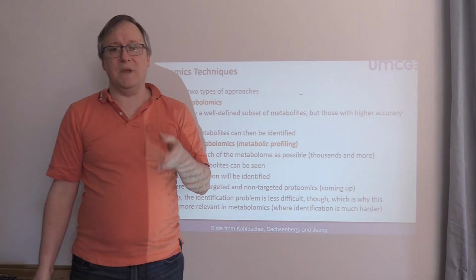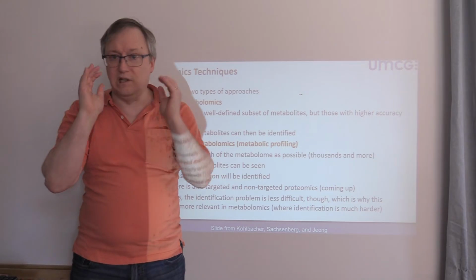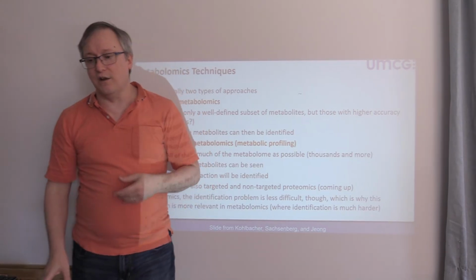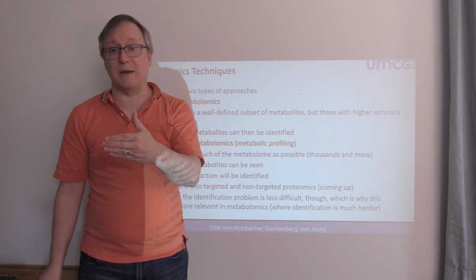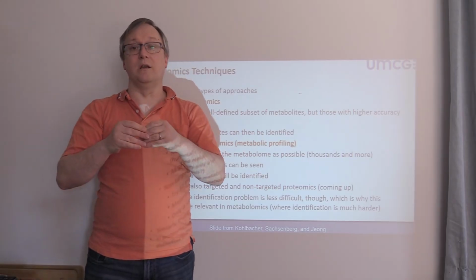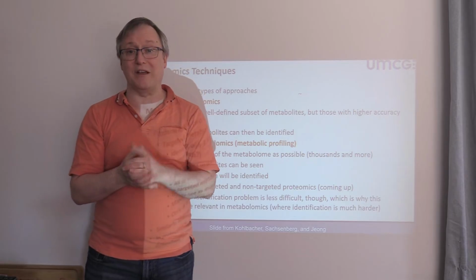But it may be that the answer you're looking for lies within the world of lipids, for example, or within the world of sterols, something like that. And for that purpose, we would be able to know what type of separation chemistry will be compatible with all these different metabolites and so on. But we still have the problem of being able to identify that. We'll spend some time talking about that in a different lecture.